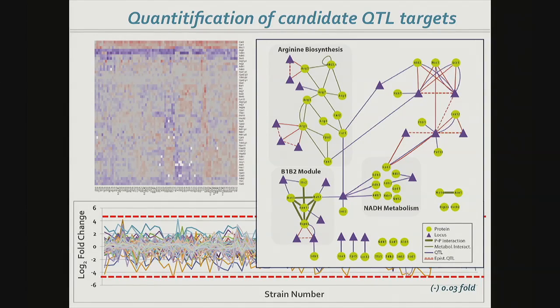So this is admittedly only a small number of proteins, about 50. And now we're actually trying to do this on a larger scale. But it is already interesting to see that there is not a one-to-one association. Most proteins are controlled in some way, genetically and by their expression. This locus here, for instance, controls the abundance of several genes. And we have cases where a protein is controlled by different loci.